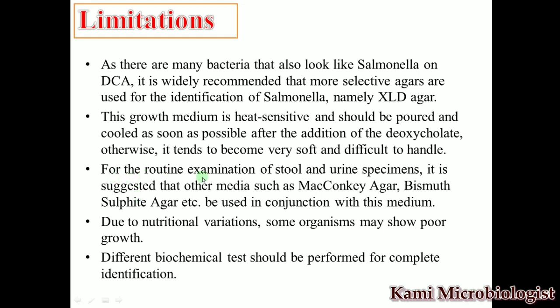Then we have the third point. If you have stool and urine specimens that you want to examine using DCA media, meaning deoxycholate citrate agar, then with this media you must also use MacConkey and bismuth sulfite agar medium, so you are not dependent on this media alone. The next point says that this media does not have a lot of nutrition, so sometimes there will be less growth of other bacteria as well. And the last point says that if you want to confirm the bacteria 100%, you have to perform different biochemical tests.